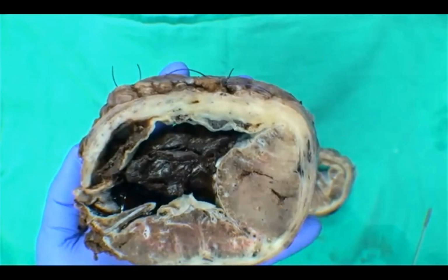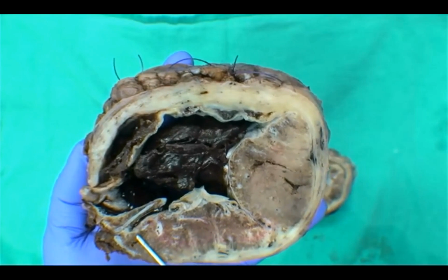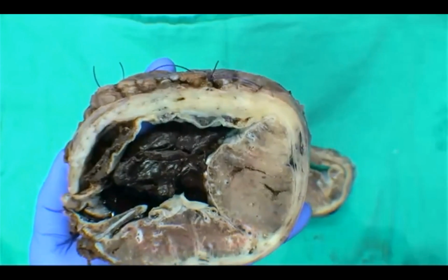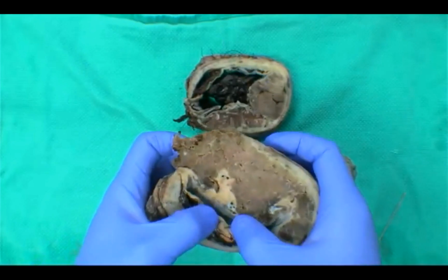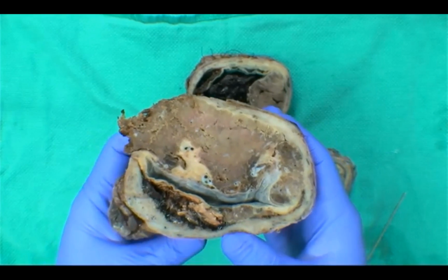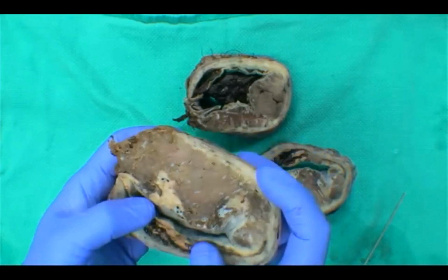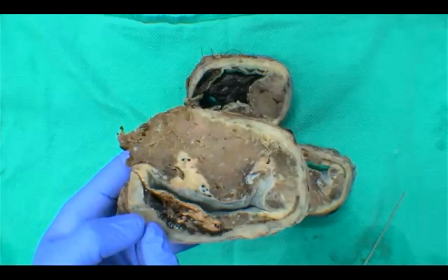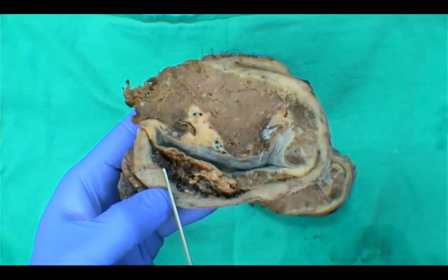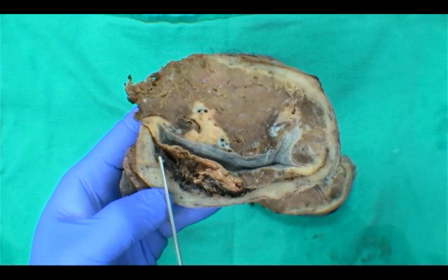Okay. Again, after you've cut these concentric rings, don't forget to measure your placenta in 3 dimensions as best as you can. You may have to do some reconstruction to get the superior inferior measurements. There'll be additional structures to make note of, including the insertion of the umbilical cord, how long it is, etc. Describing the fetal surface, the cut surface of the placenta itself, as well as uninvolved endomyometrium, where you can see there's some old hemorrhage, some organized blood clot, as well as some newer blood clot down here.